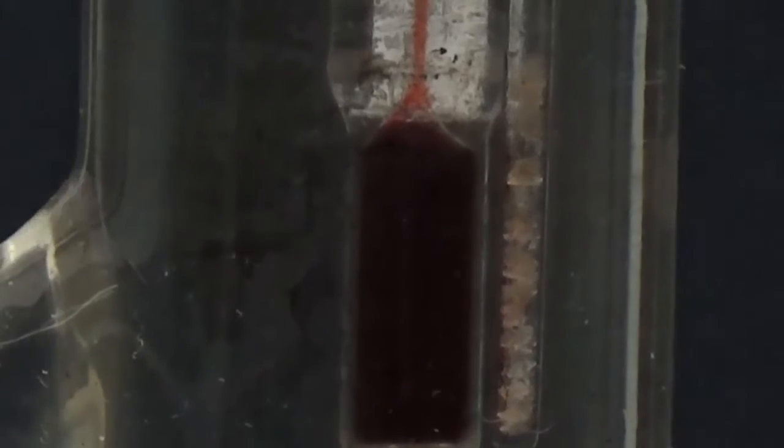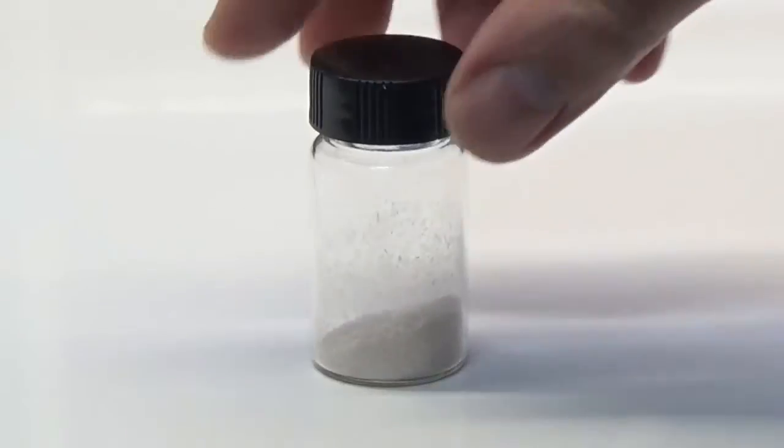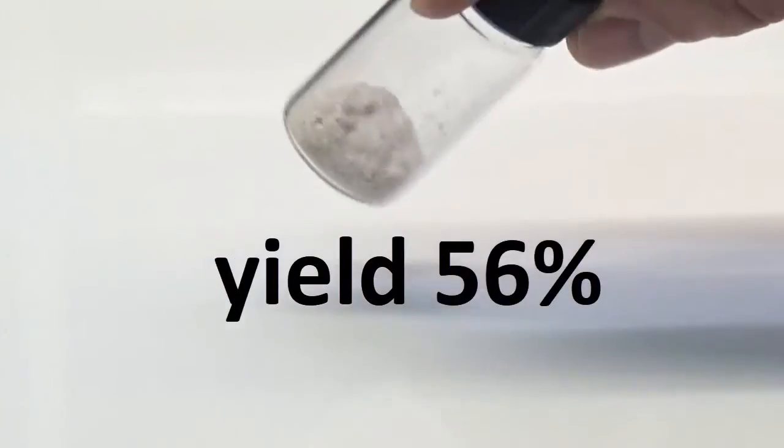If the melting point is lower than 150 degrees it is convenient to recrystallize to purify. This melting point indicates contamination by phenacetin which has a melting point of 133 degrees. The yield of this synthesis was 56%.